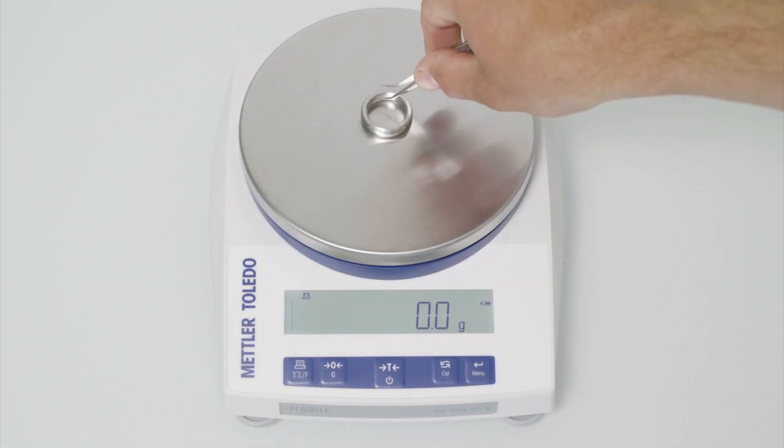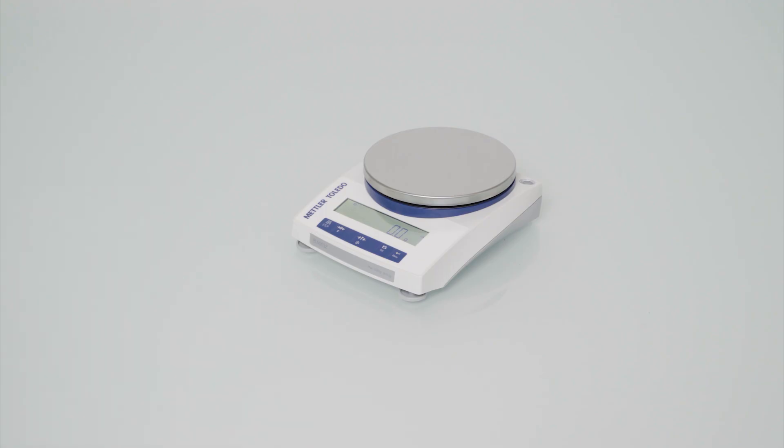The backlit display with large figures is easy to read in both bright and dim lighting conditions. Even from far away you can see the numbers clearly.